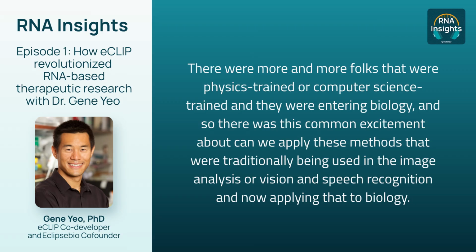So we spent about 2 to 3 years basically just doing characterizations of antibodies for the ability to IP, or immunoprecipitate, an RNA binding protein-RNA complex. And then we realized even with these antibodies, because they vary a lot in quality, the traditional CLIP-seq or crosslinking IP sequencing method was not as easy to deploy or robust for us.